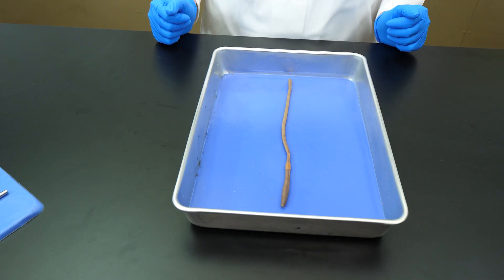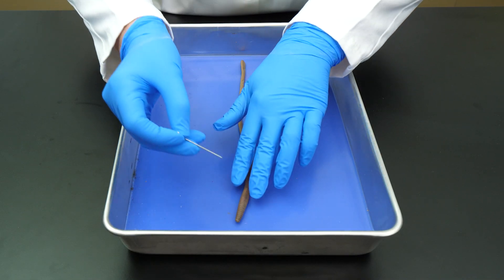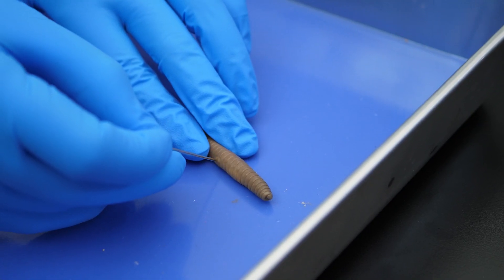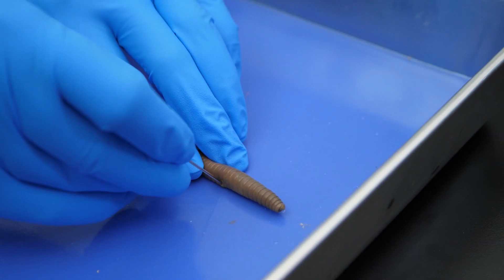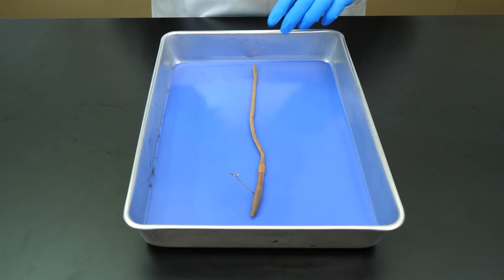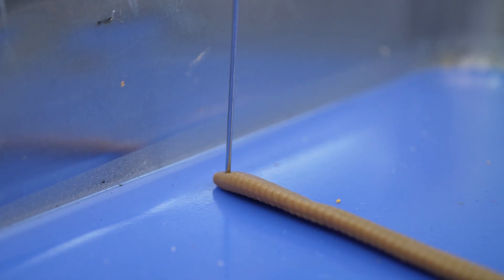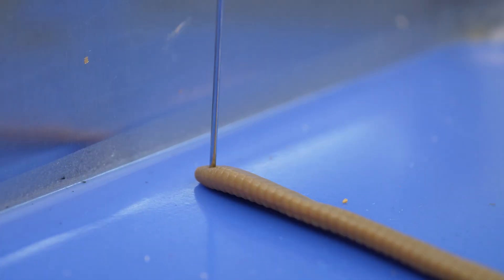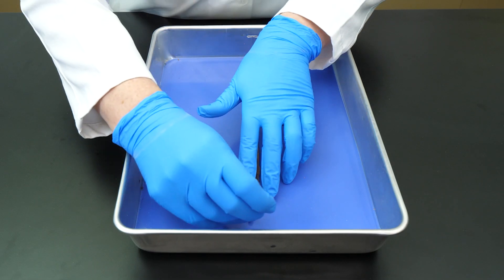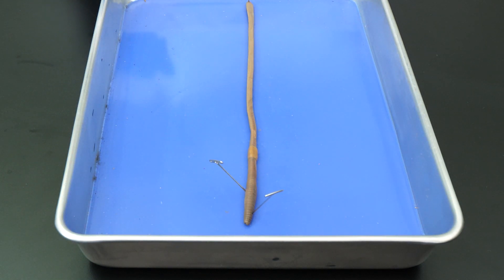Most of the earthworm's internal organs are located in the anterior portion of the worm. To avoid damaging internal organs, we will stick a pin into the worm's side and push the pin into the pad beneath the worm. Next, we stretch the worm out in a straight line and stick a second pin into the worm's posterior region. Since we will not be examining the organs in its posterior region, we can stick the pin straight in. To hold the worm in place while we begin our incisions, we will place one more pin in the anterior region.